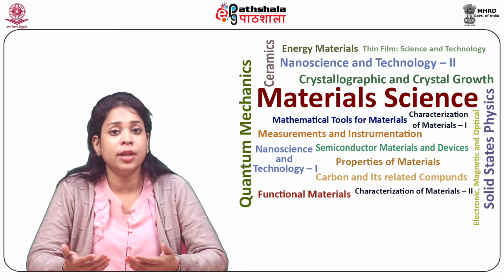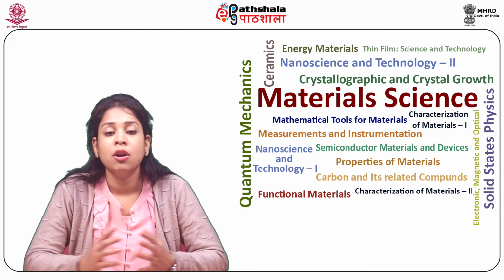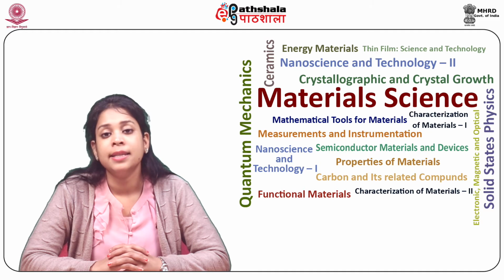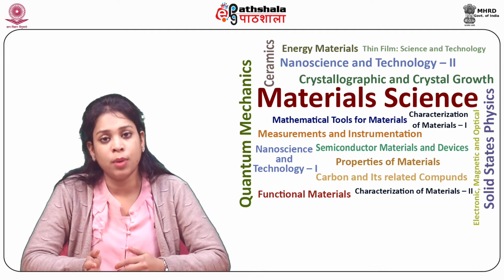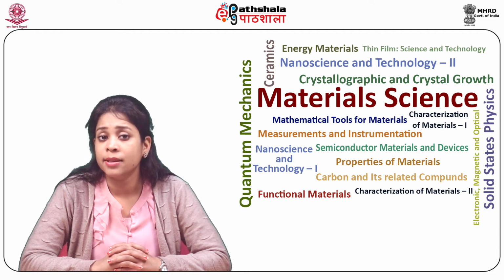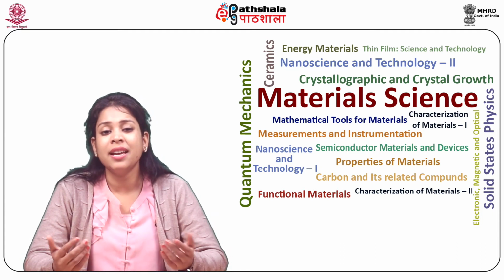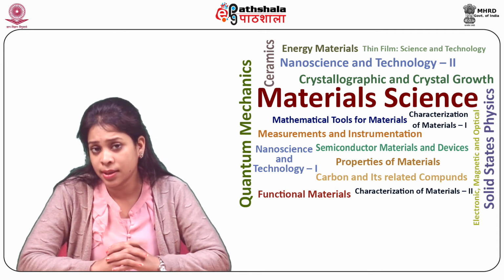So these components of the field gradient tensor are used to define eta, or the asymmetry parameter, which is equal to q_XX minus q_YY divided by q_ZZ, and it varies between 0 and 1. Eta equal to 0 corresponds to an axial symmetry along the z-axis, while eta equal to 1 corresponds to the two-dimensional gradient effect. So eta is usually described in percentage from 0 to 100%.